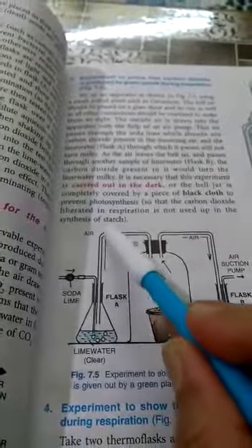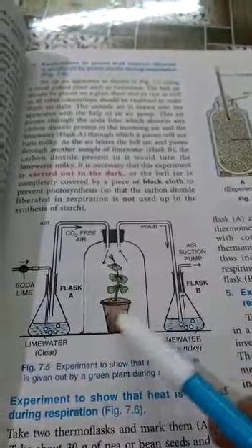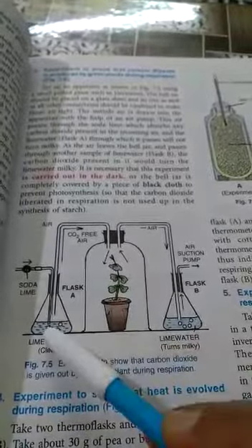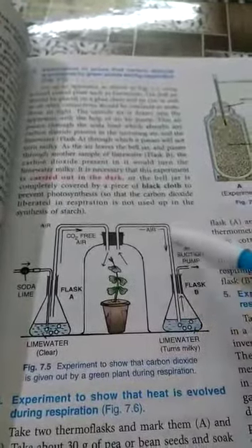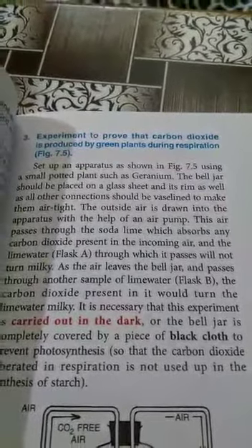This carbon dioxide free air is then passed to the plant present in the bell jar. This plant will respire and release carbon dioxide. So the carbon dioxide released here is coming from this plant. It is not coming from the air, which was already absorbed here. It is coming only from the respiration of this plant. When this carbon dioxide passes into flask B, which also contains lime water, the color of the lime water will become milky. So this experiment proves that carbon dioxide is produced by green plants during respiration.